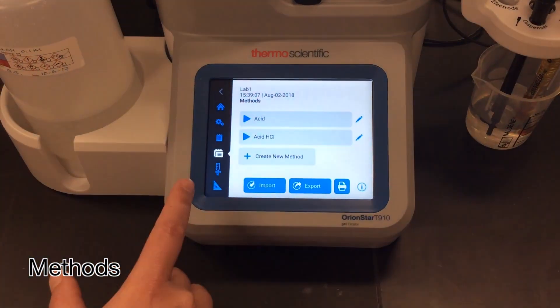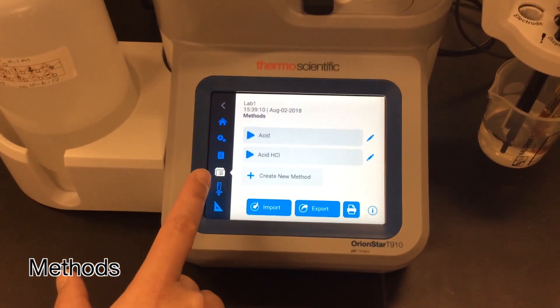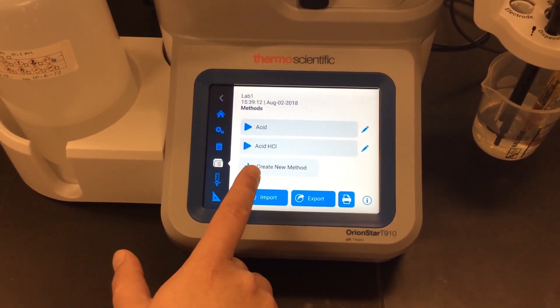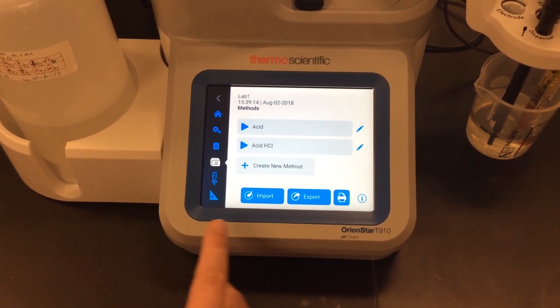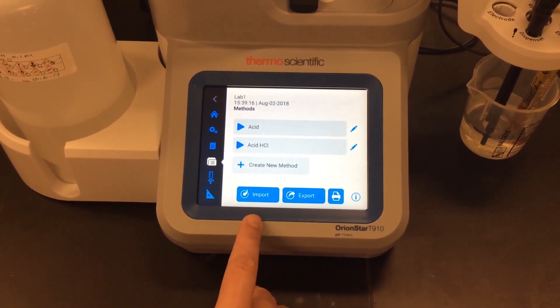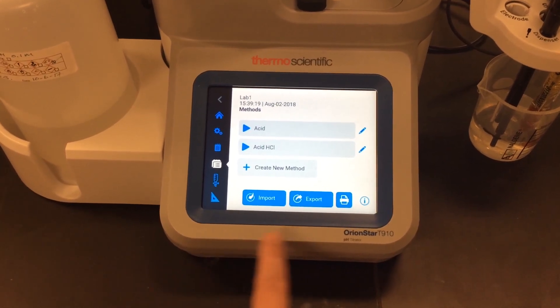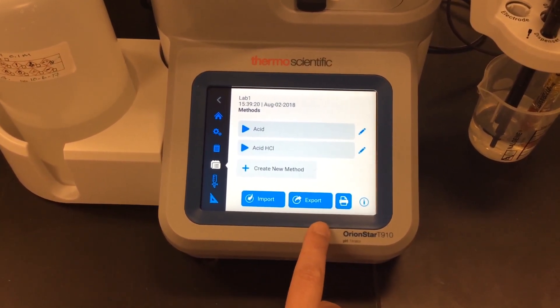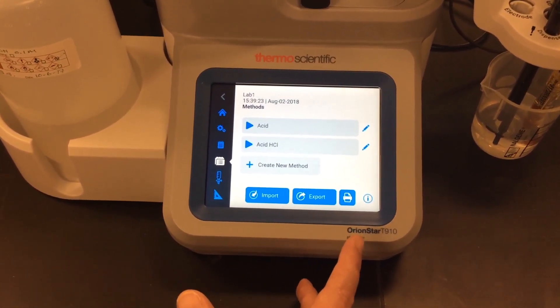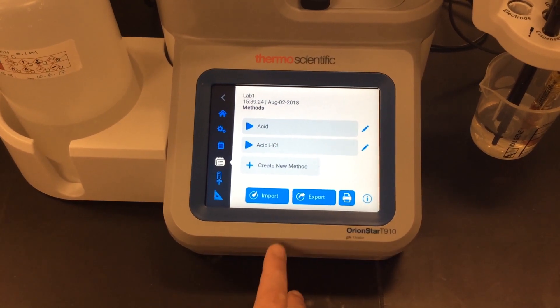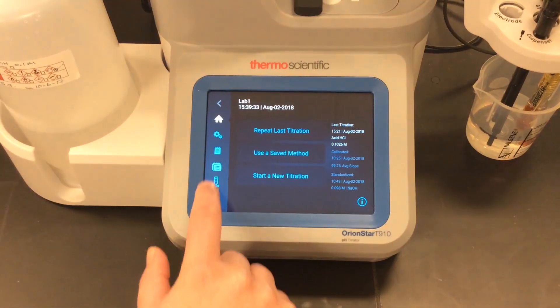The next screen is my method screen. From here I can see I already have two methods saved, and I can create a new one — up to 10 total. I can also import methods from a USB flash drive or export them to a USB flash drive to load onto another titrator. A third option is to print out my methods.